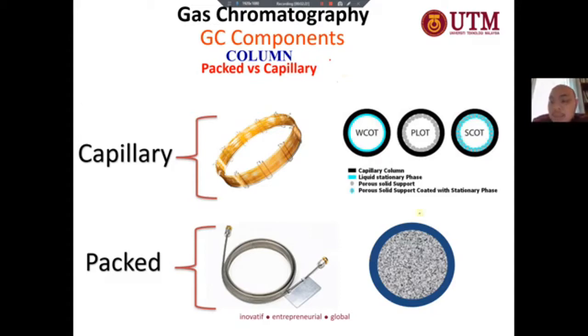By history, the packed column is just a wall of steel, and then we have so many solid particles of micron size. Right now, I just draw them as large. In your examination, if asked to draw the packed column, you don't need to make the dots as detailed as this.